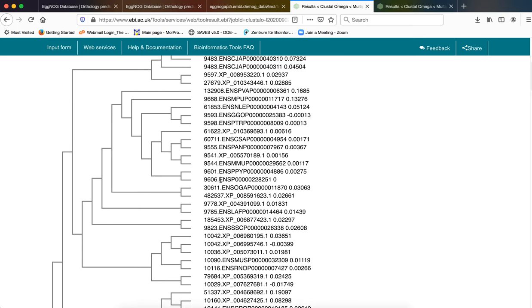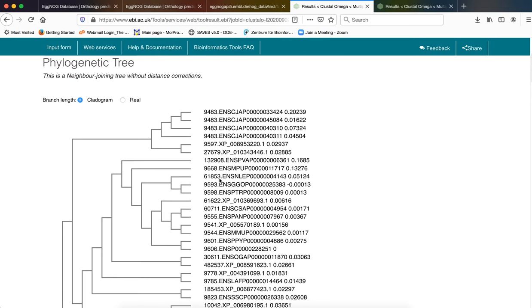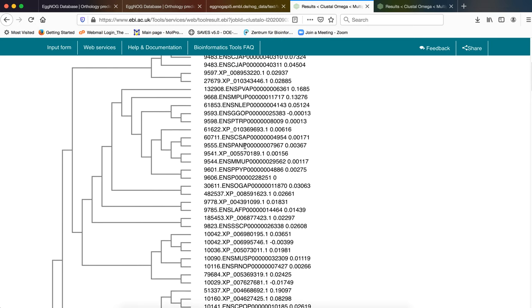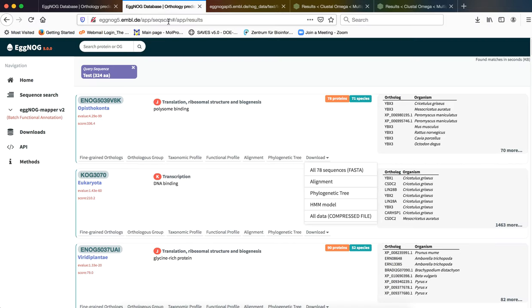So then what we need to do, we need to then copy and paste this particular image of the tree and save it for our future use. Following that we will again go back to our eggNOG result page which is this page. And we will click on the phylogenetic tree that the eggNOG page was providing us with.